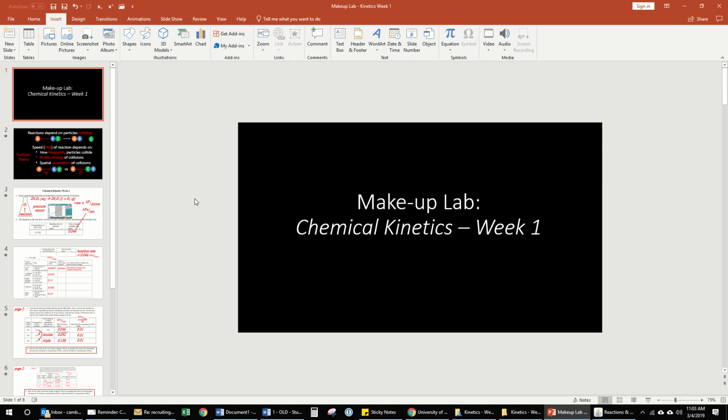This is the makeup lab for Chemical Kinetics Week 1. What we're going to do is run through the first couple of pages of the lab handout in your lab manual called Chemical Kinetics Week 1.